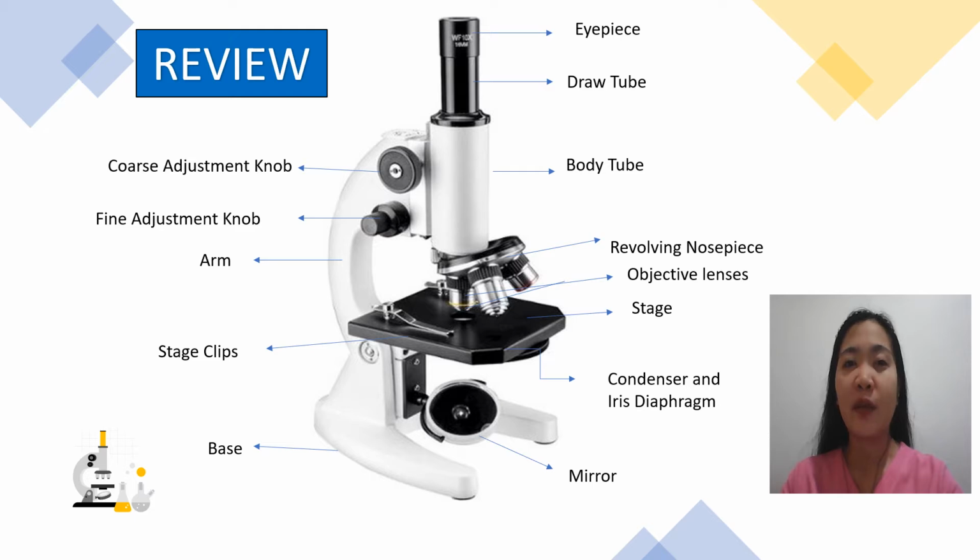These parts are very important in focusing specimen under the compound microscope.